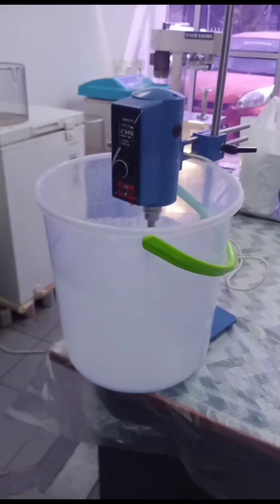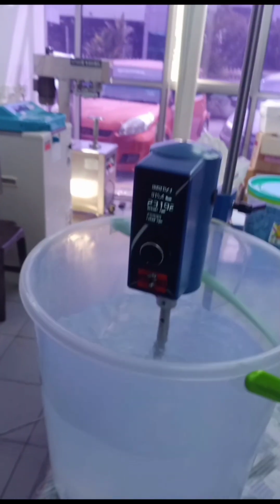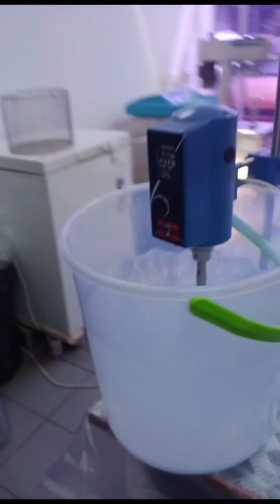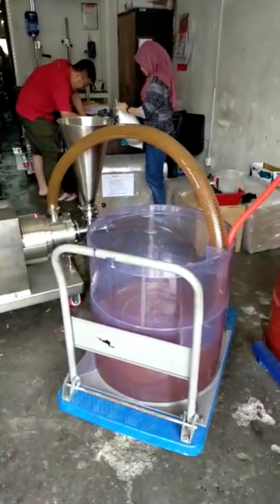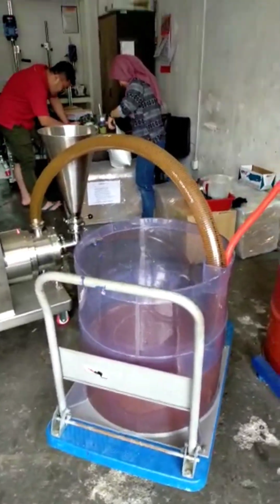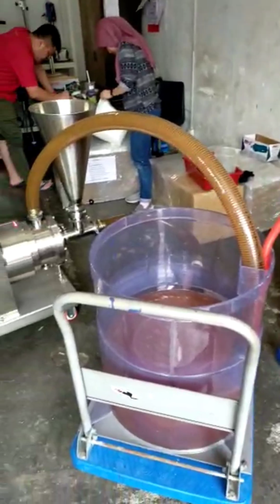7. Optimization. Iterate the design based on the testing results to optimize the shear rate and flow rate according to your specific requirements. This may involve adjusting the tooth number, slot width, or other geometric parameters. Remember, the design of a homogenizer stator and rotor is a complex task that requires expertise.